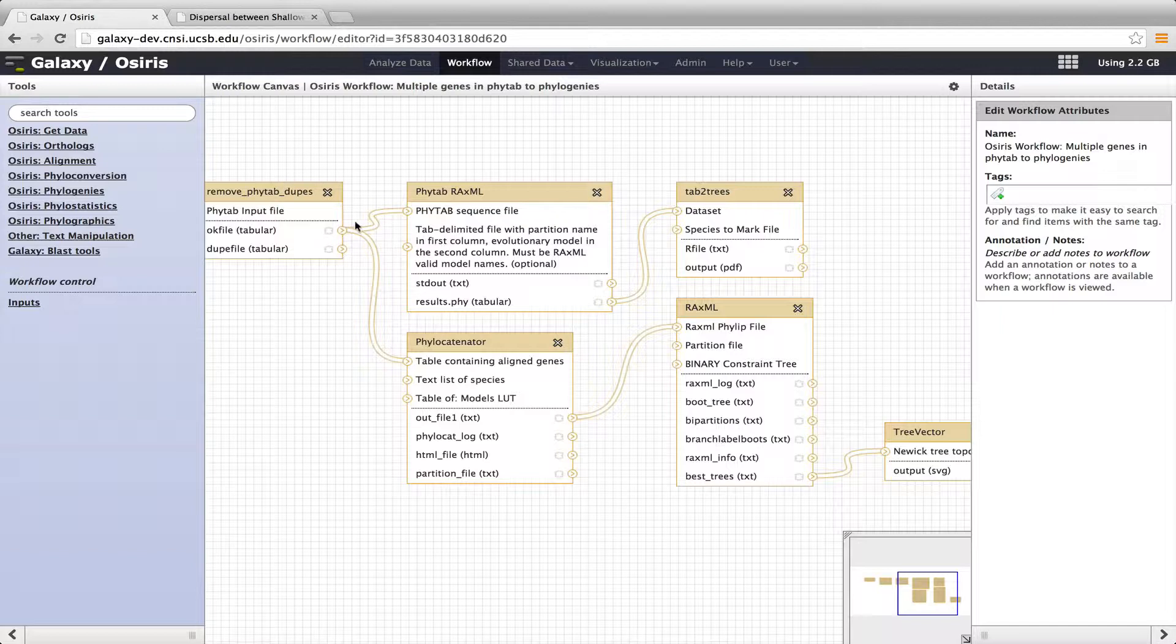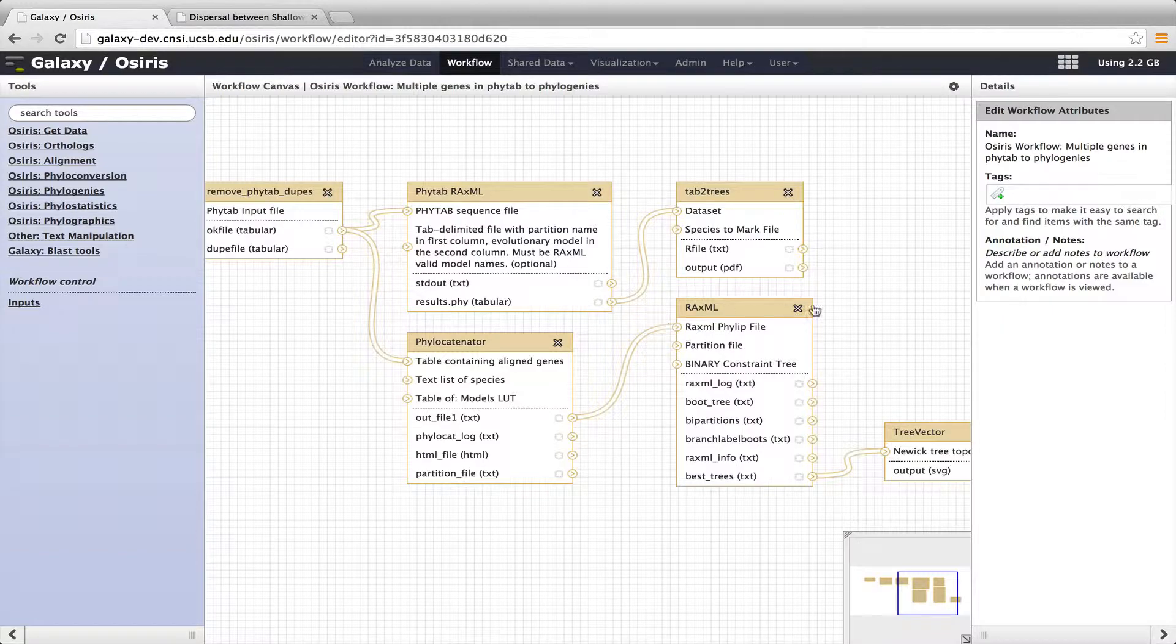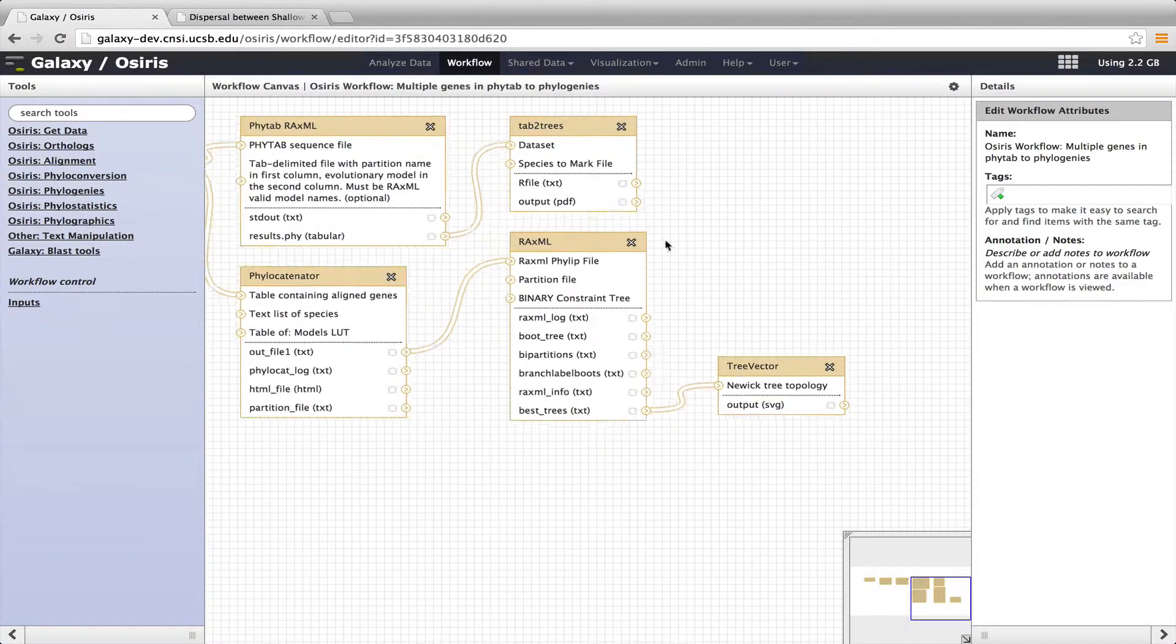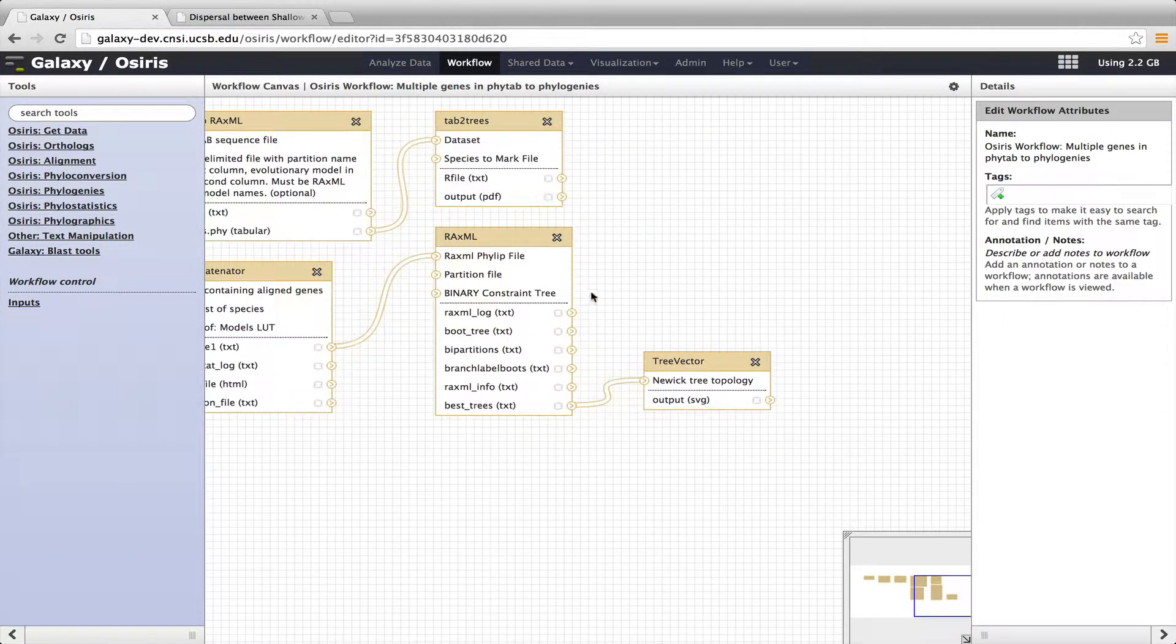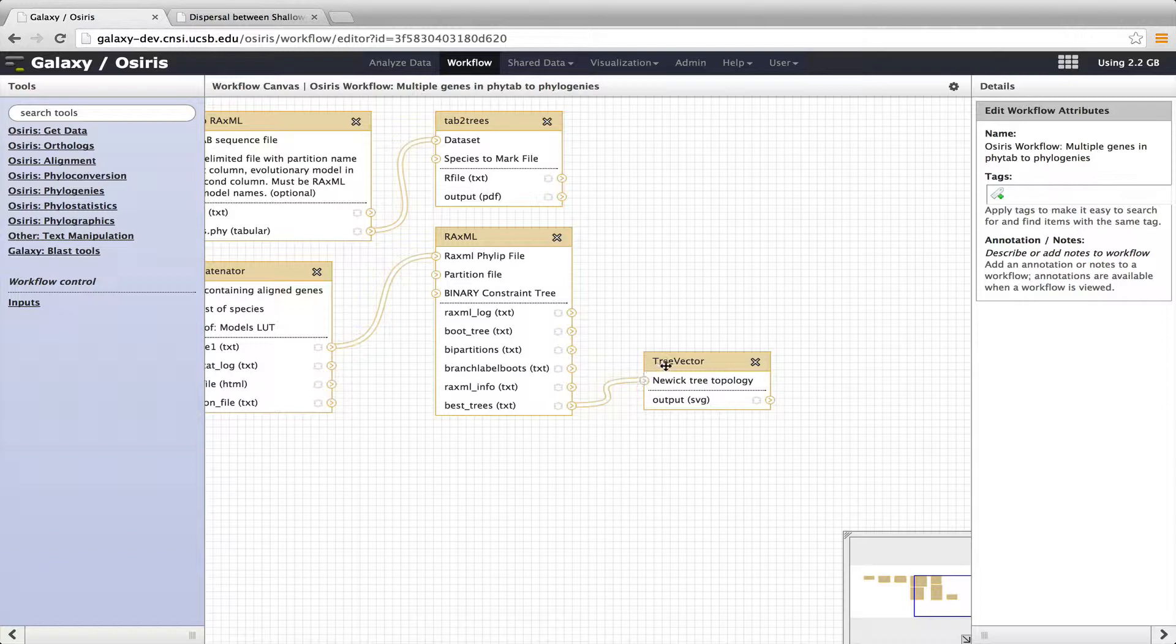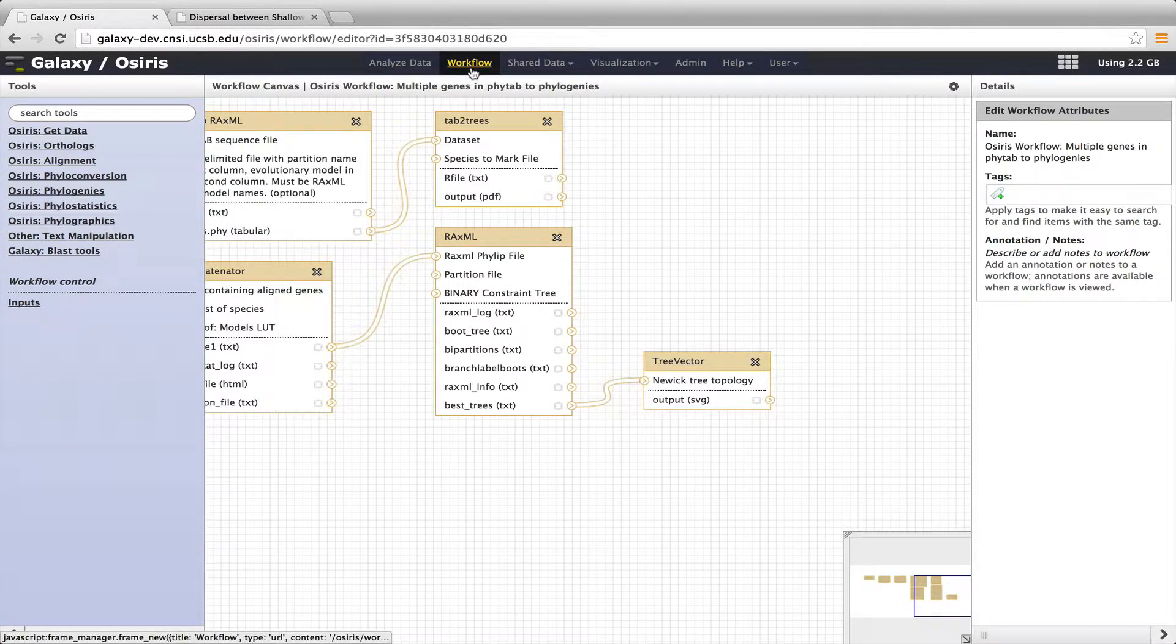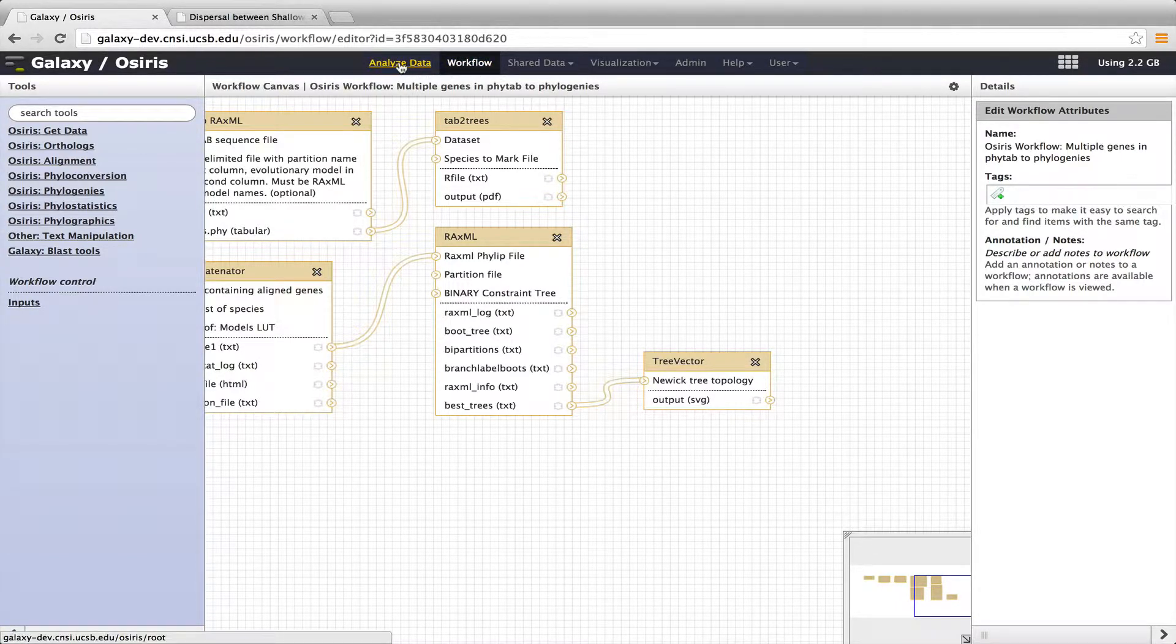So Remove PHYTAB dupes makes a gene tree for each separate gene, but it also splits off here and goes into phylocatenator, and phylocatenator concatenates the data based on species and gene and into a single data set. And then the out file here gets passed into RaxML, and RaxML then generates a maximum likelihood phylogenetic tree based on the concatenated data. Then the output of that, we put the best tree into this tool called Tree Vector, which visualizes the concatenated phylogenetic tree. So that's the workflow that we're going to run.